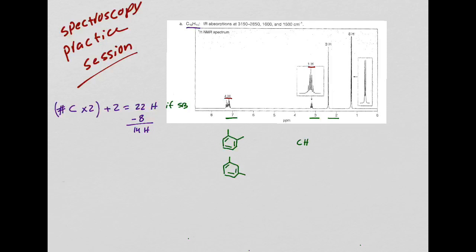Now, I know I don't have an oxygen, so I know this is not a carbon next to a carbonyl, right? Because usually when you see a peak at 2.2, you go, oh, a carbon next to a carbonyl. And we know that's not the case because we don't have an oxygen. So again, the formula really comes in handy. The integration is 3 hydrogen, okay? So maybe I'm looking at a CH3, and it's a singlet. So this CH3 is attached to a carbon that has absolutely no hydrogen. Okay, so that's a good piece of information. I like it so far.